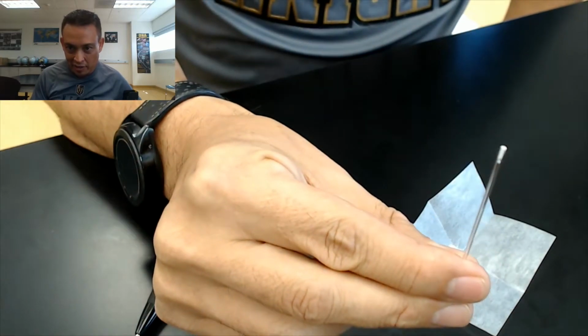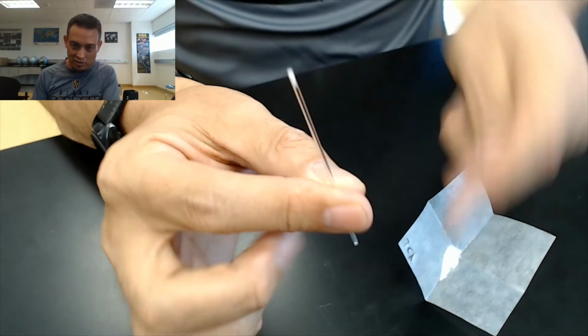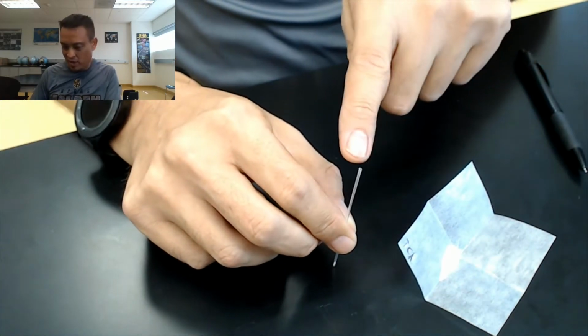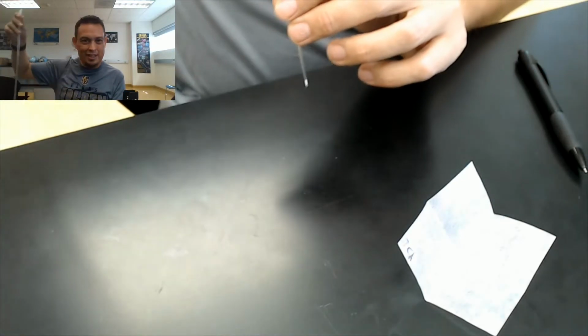So you see how the solid kind of got stuck in the top there? And then now we have to get it down to the closed end. The easiest way to do that is just simply tap it on the bench. It actually worked really good with this particular solid, but sometimes the solid will have a tendency to stick at the top here and not actually come down. And the best way to address that is to use a long glass tube.